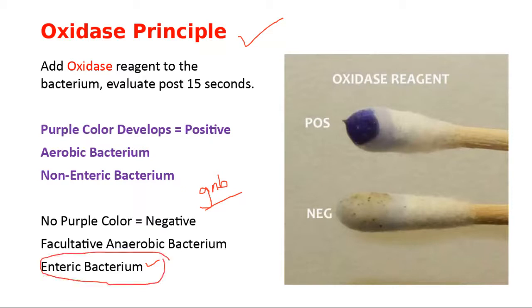Okay, good. Because lots of people talk about enteric bacteria, and they'll talk about cocci that are enteric. Yeah, but that's not the enterics that we know as being pathogenic, right? We're talking about gram-negative bacilli. Okay, so this is an important slide. You should know this, right?